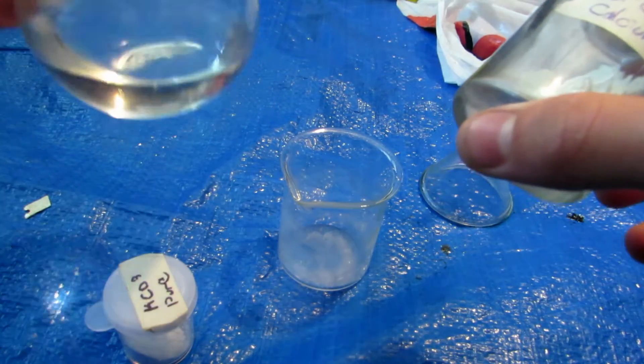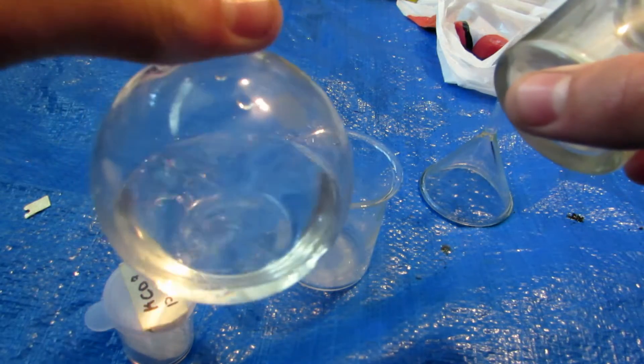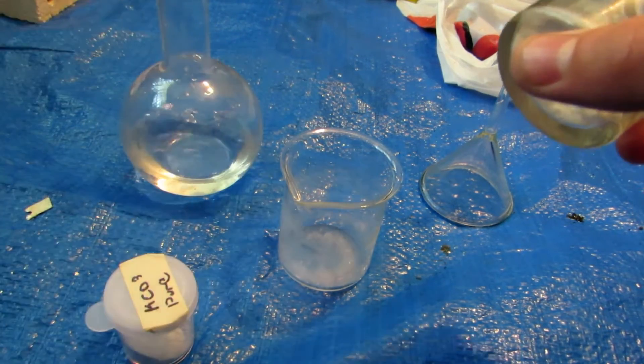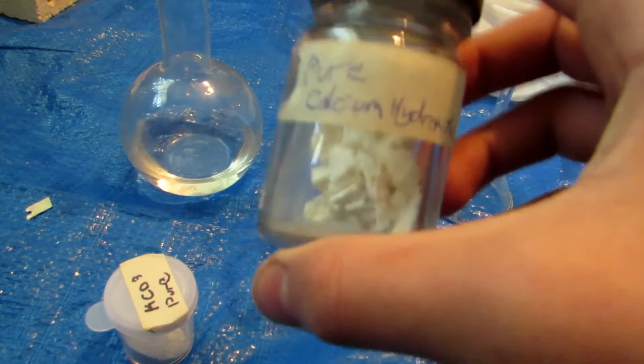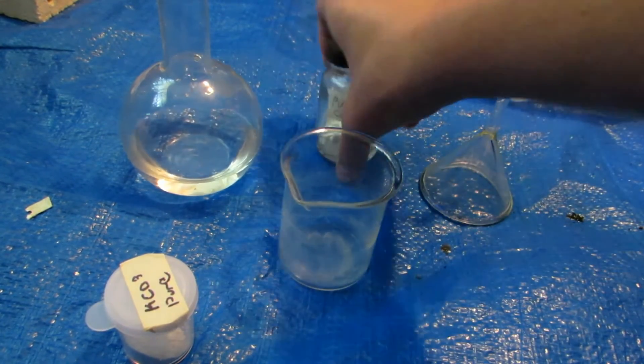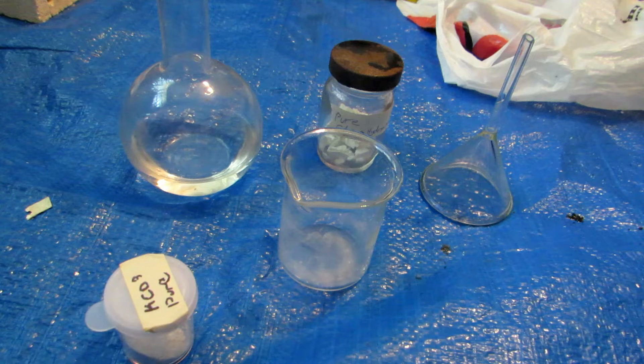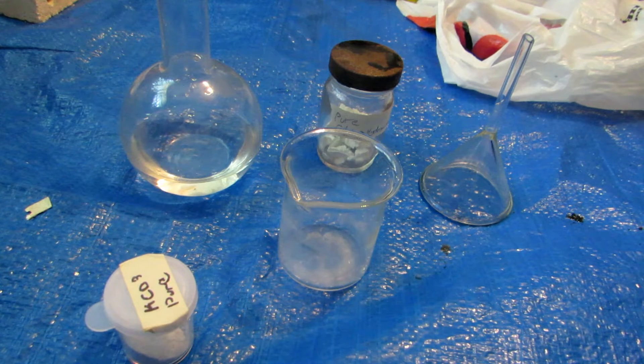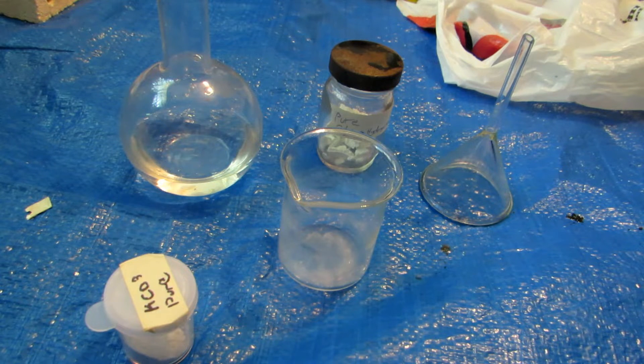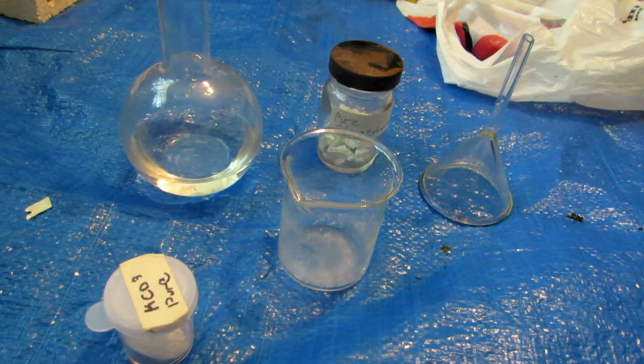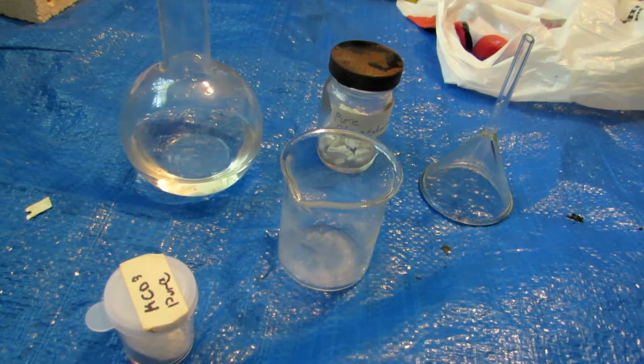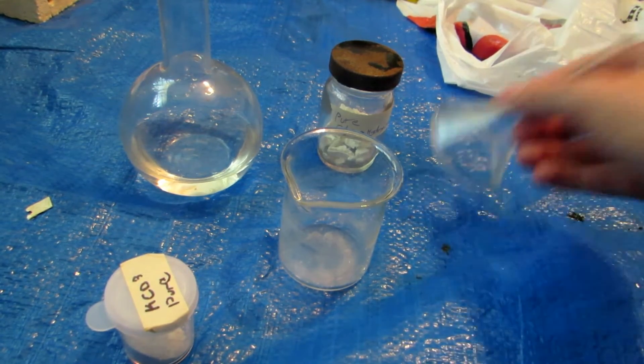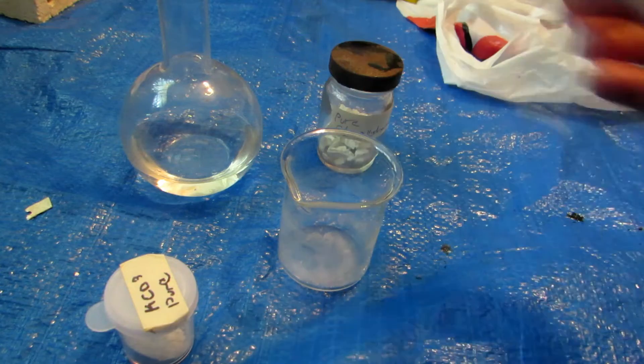Now this calcium hydroxide was also made in a previous video from some other very simple household materials. So we're going to start by taking a fair amount. The exact ratio doesn't really matter. We're just going to take some distilled water, make sure it's very pure distilled water, and add some calcium hydroxide into it.